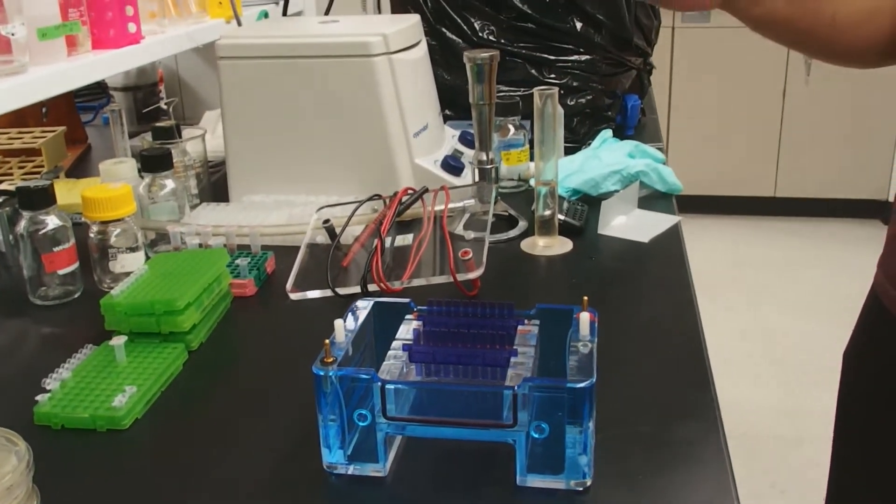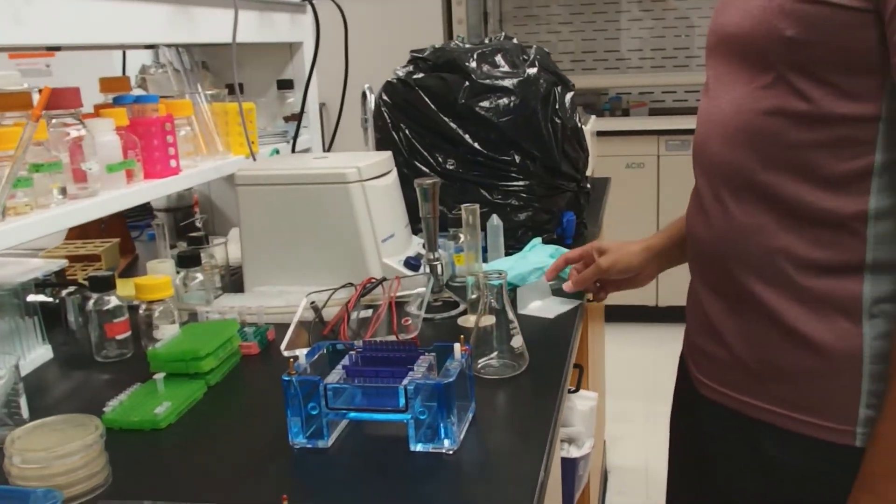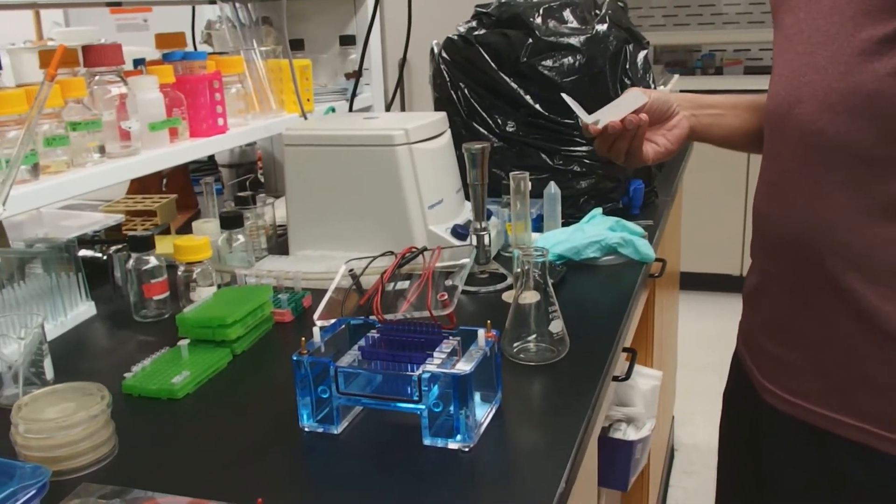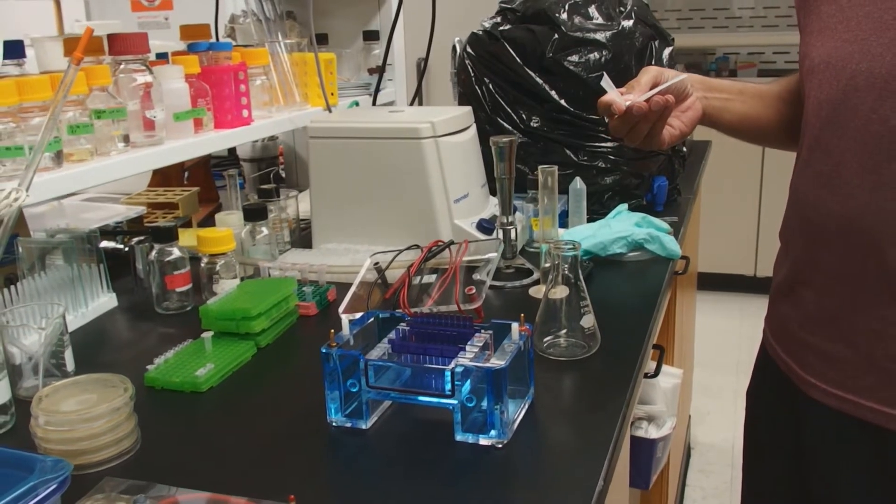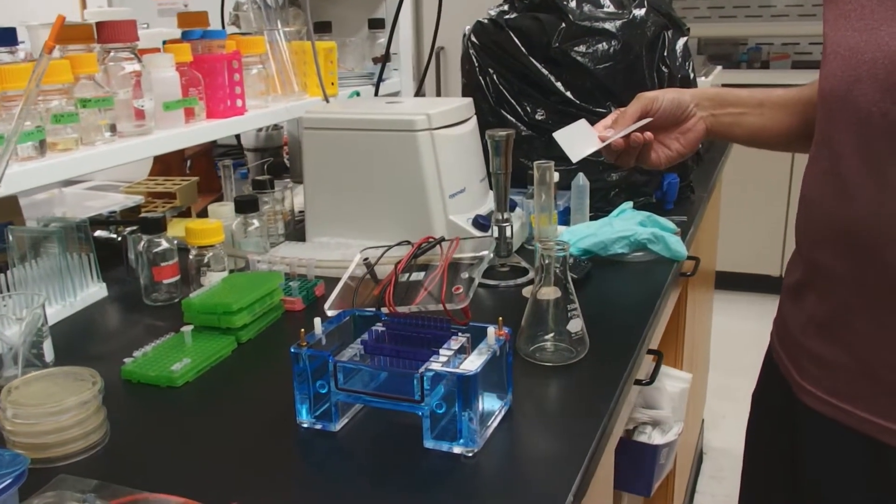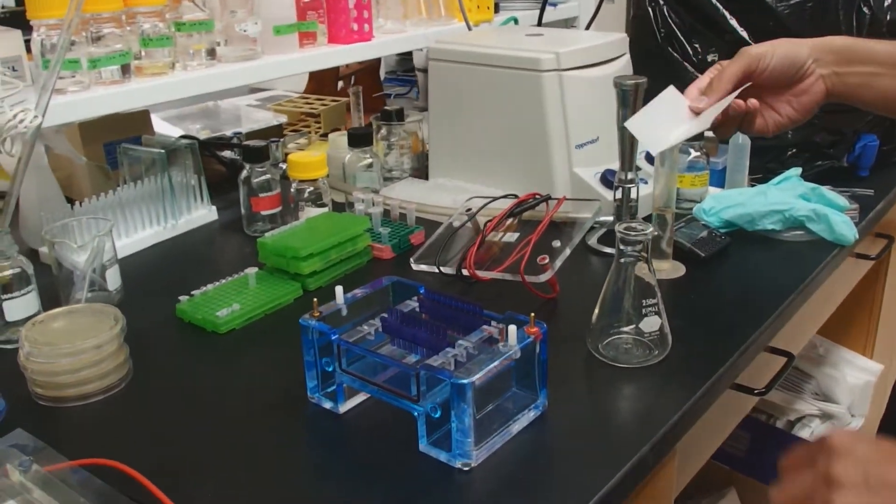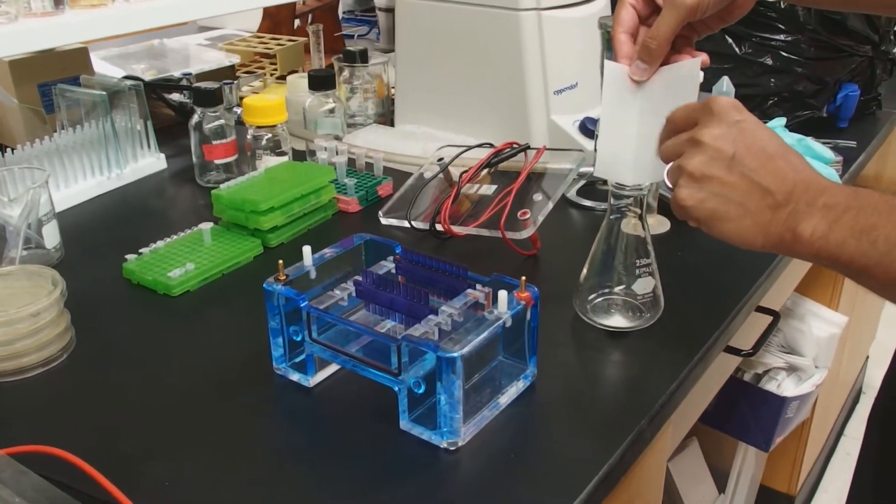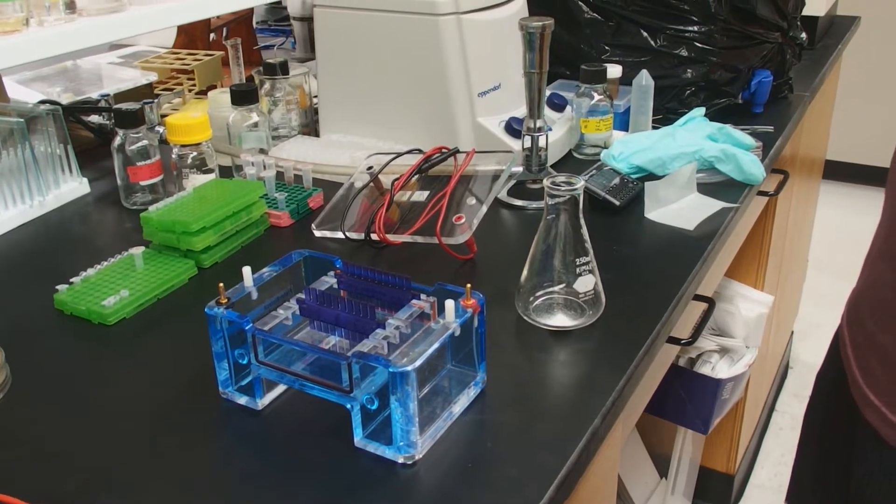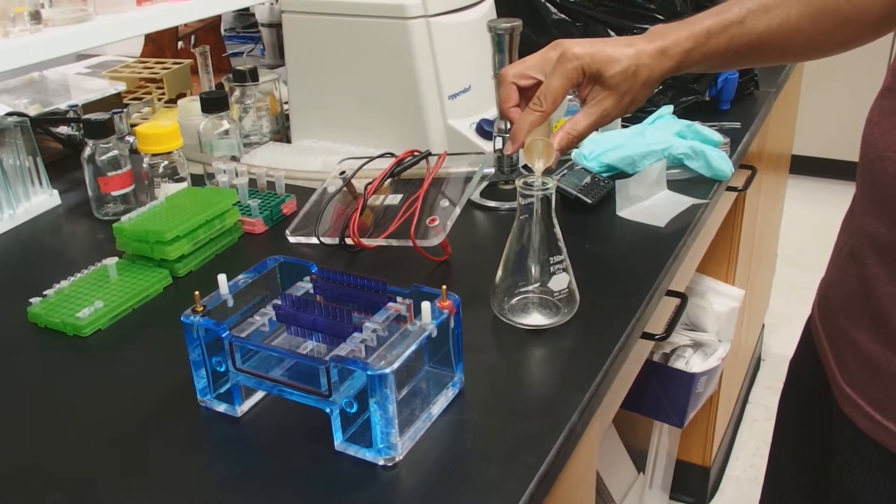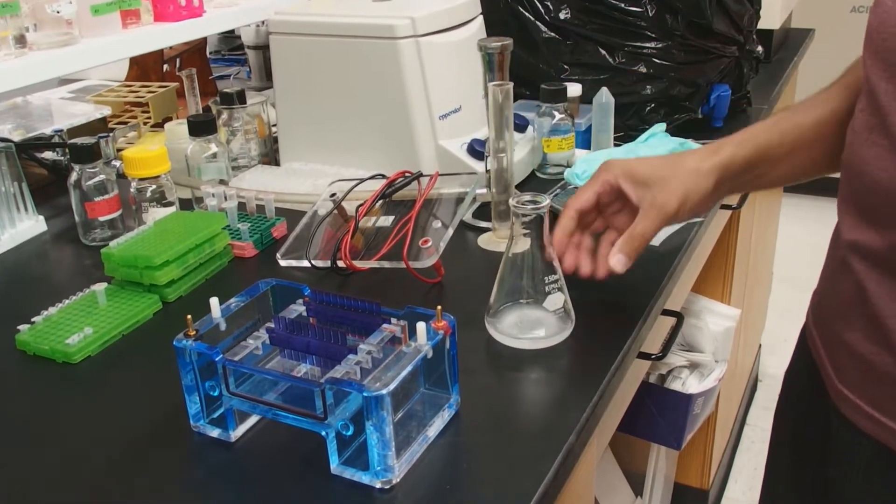Now we have to prepare our agarose solution. We need an Erlenmeyer flask or a bottle. We need agarose. We're going to prepare a 1.2% agarose gel. That's the standard agarose percentage. And we're going to prepare 25 milliliters of this. So here I have 0.3 grams of agarose. Put that into the Erlenmeyer. And I have 25 milliliters of TAE buffer. Put that in there. And now we have to microwave this. So let's go over to the microwave.